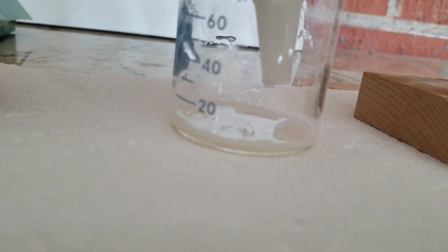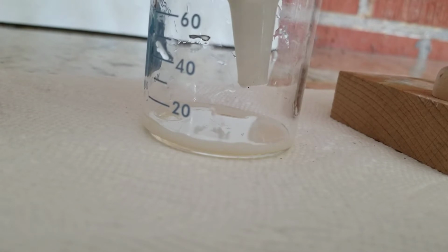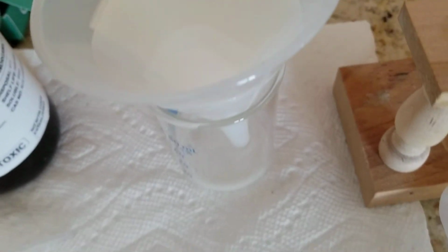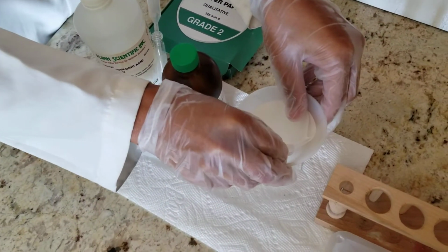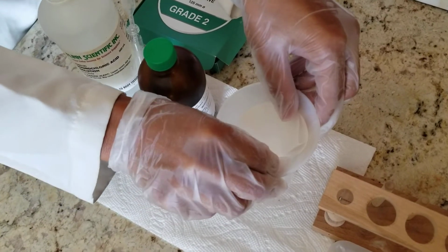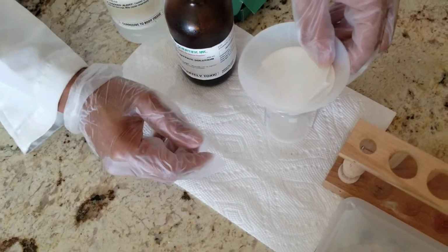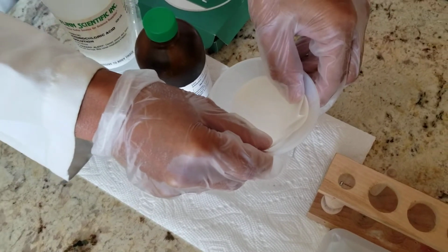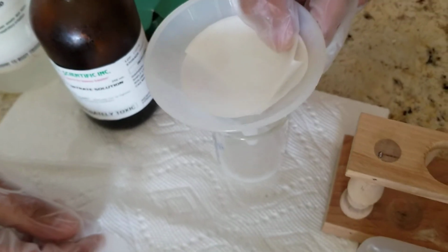A big portion of sunlight is a mixture of different radiation, and the one that we're looking for specifically is ultraviolet. So that's something that will cause a secondary change in this particular demonstration. So perhaps a few more seconds here. One way to encourage the filtration process is to shift your filter paper a little bit without breaking it. Filter papers tend to break pretty easily if you use anything that's sharp. It's getting close to finishing there. Let's try to encourage the filtration process to happen much quicker.